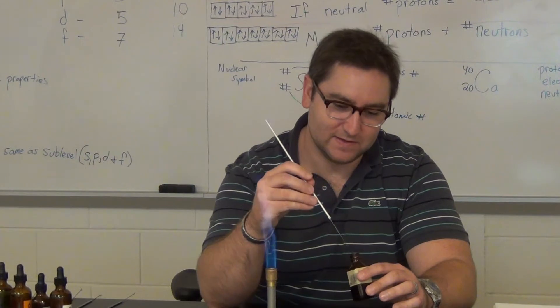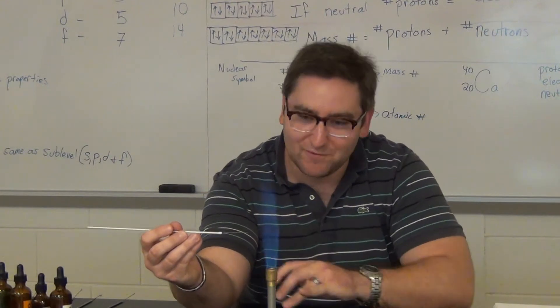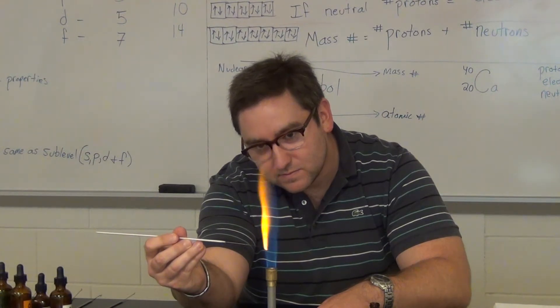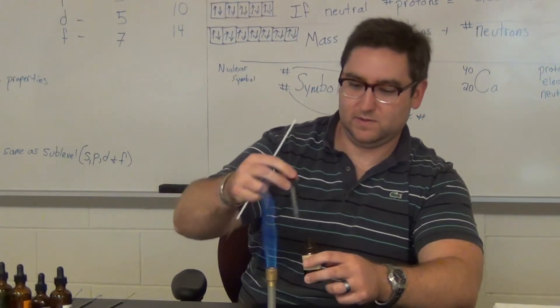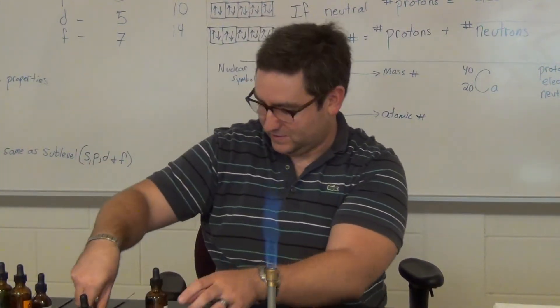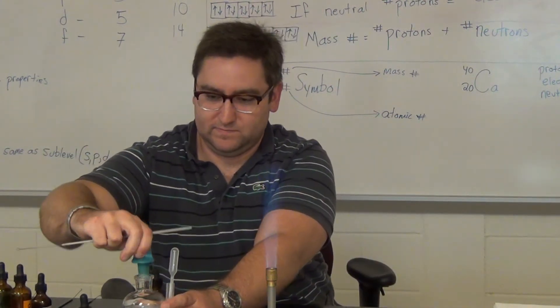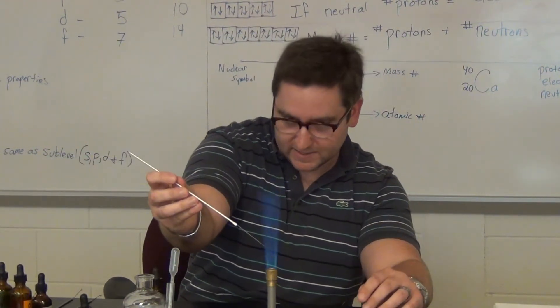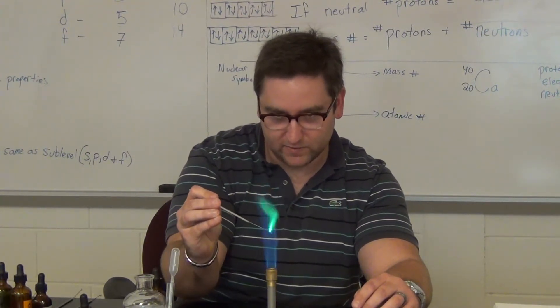It's not supposed to be green — oh, it's orange? They didn't clean these. So now that we've cleaned it off with some heat, here's our real calcium. I'm going to burn off the other ones too — I'll go ahead and assume that none of them are clean and just burn the rest off.